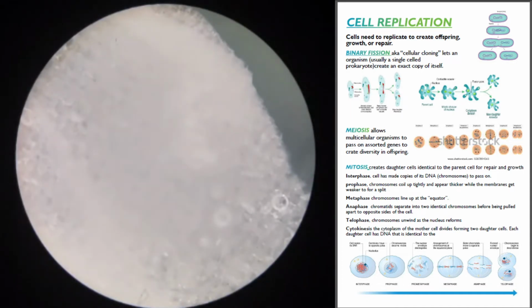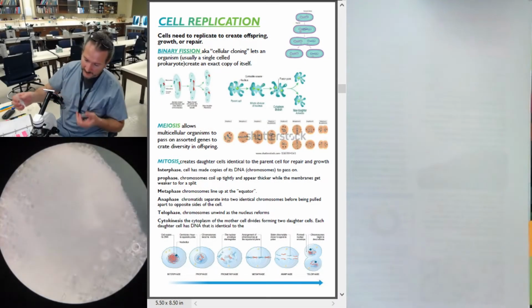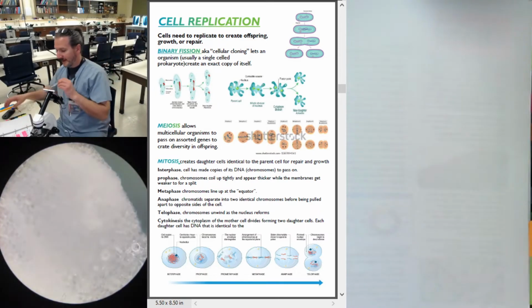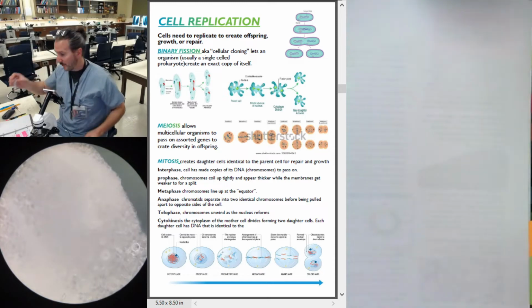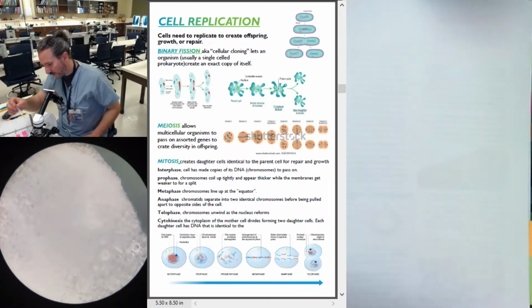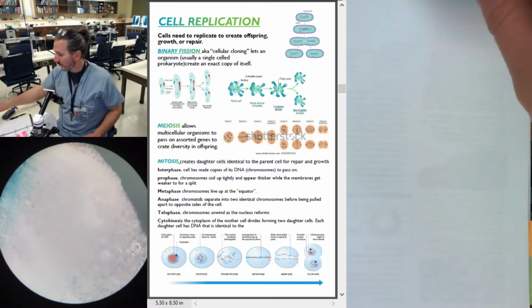Right. So I have, you can't really see it I guess from this perspective either, but I've got a little puddle of methylene blue sitting over, but there's a bubble or something that's isolating it. So I'm going to take my dropper again. Oh yeah, I do have a little. I'm just going to put it right next to the methylene blue, and that water just pushes the methylene blue right in.